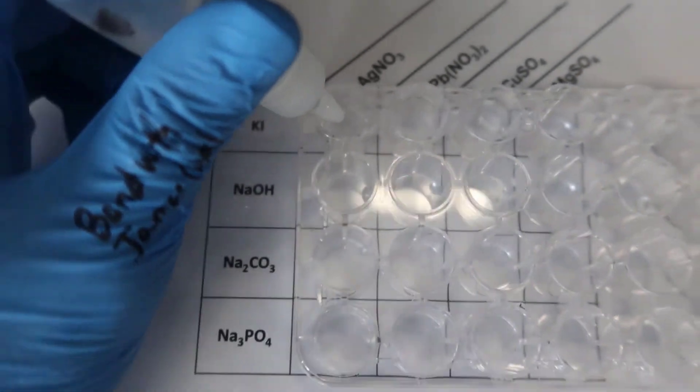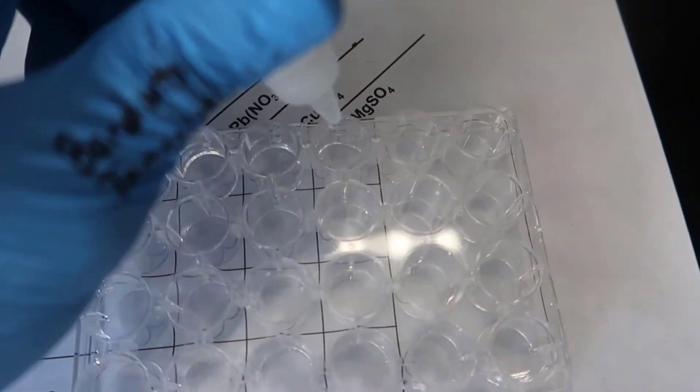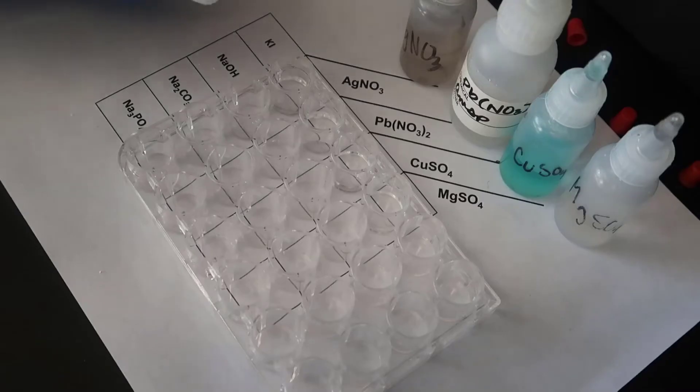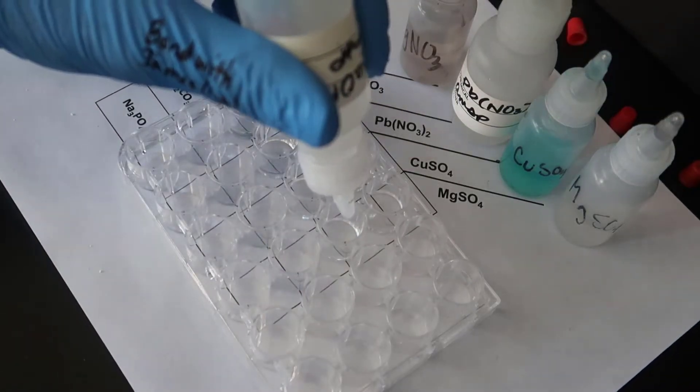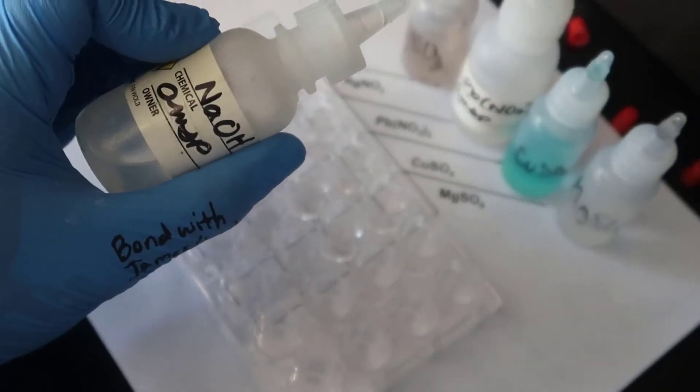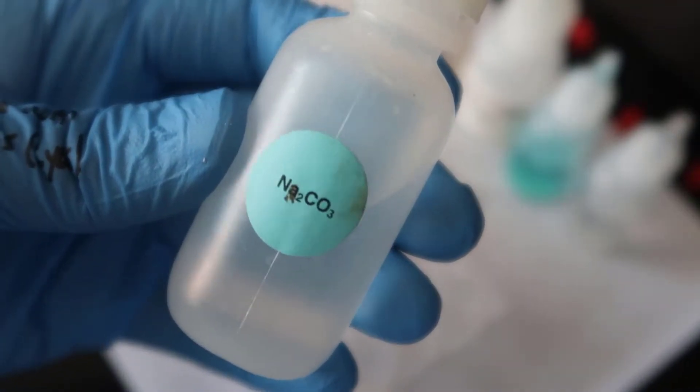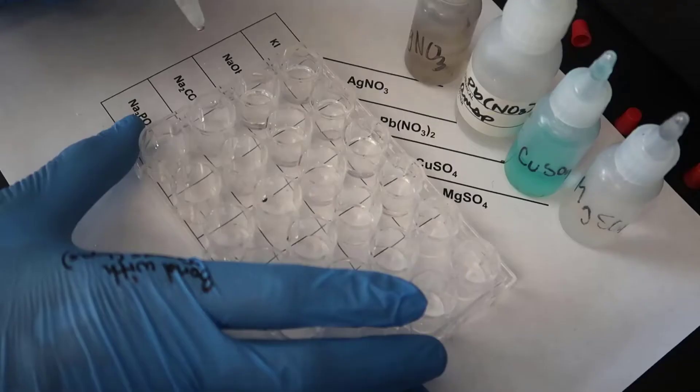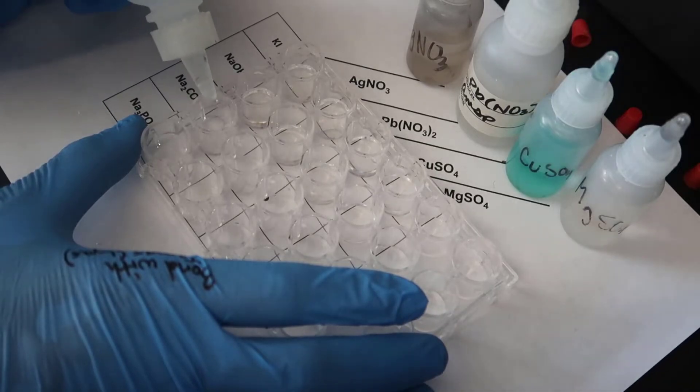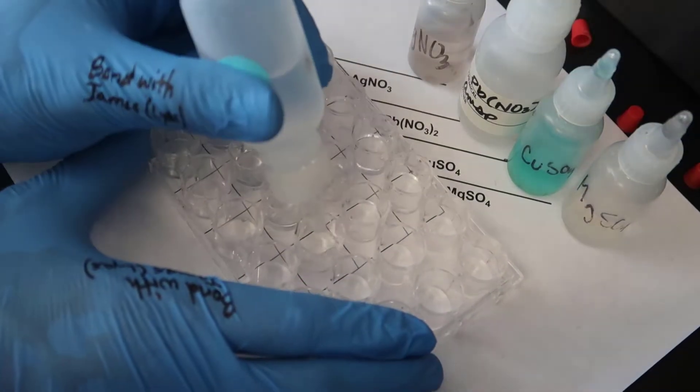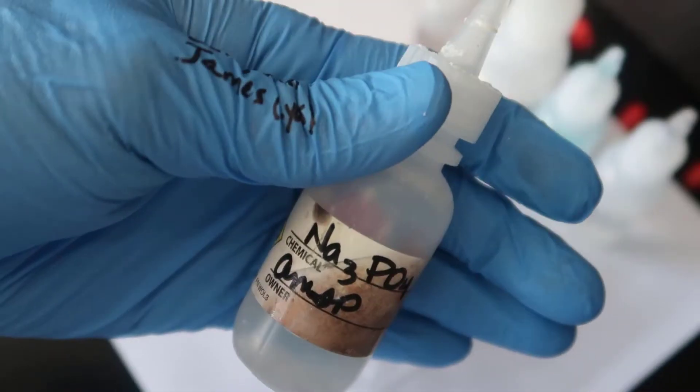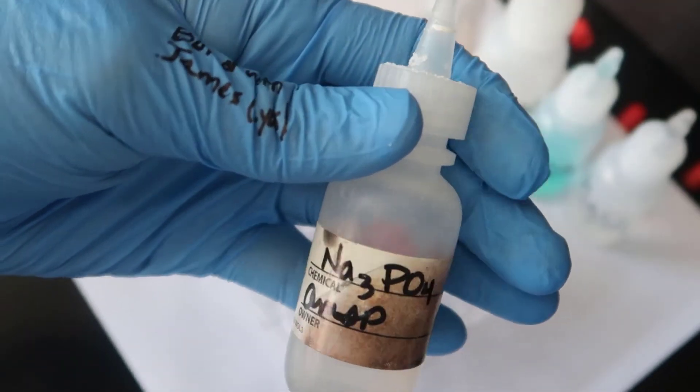So here is the KI. Okay, so that was the NaOH. Now I am going to add the Na2CO3. And then lastly going across the row, Na3PO4.